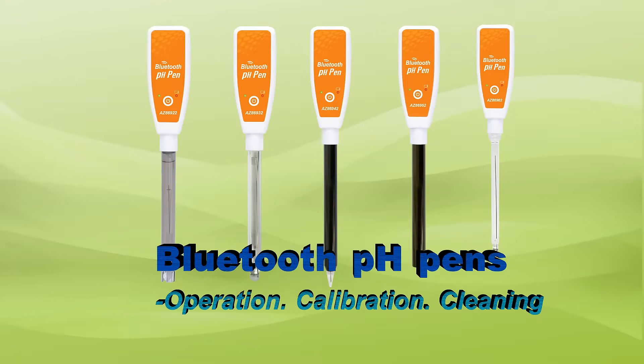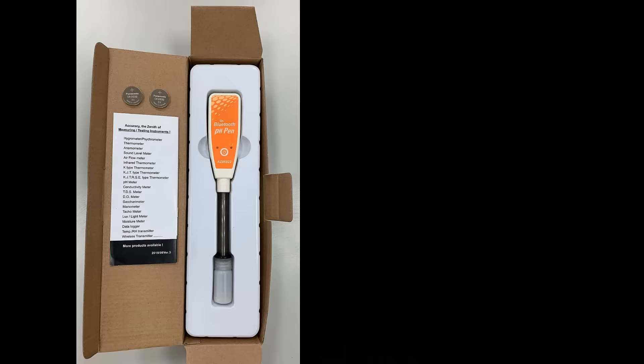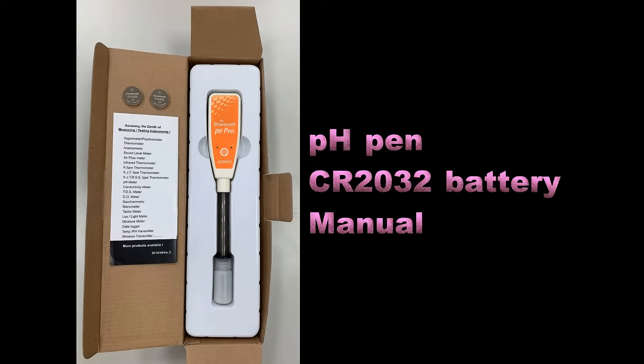AZ Bluetooth PH Pen Series. PH Pen, 2 CR2032 batteries and manual are included in each package.